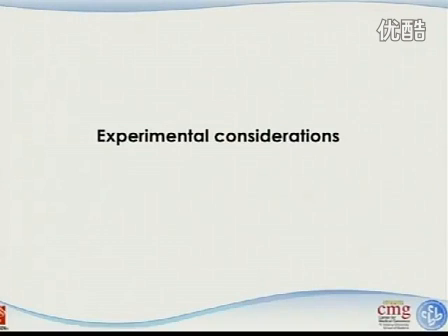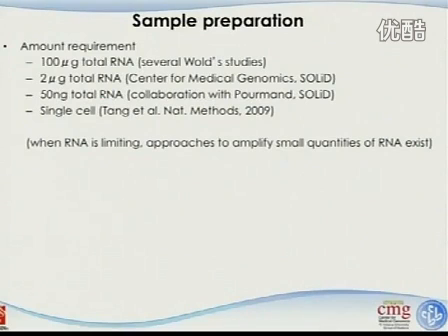Are we okay still? All right, still early to have a break, so let's go through to the next topic, which can be brief: experimental considerations. Once you do, as a biologist, when you do the RNA sequencing experiment, the first thing that you want to ask is how much initial material do I need to provide, right? This is not the blood samples. This is not the DNA sequencing, where you get the blood and you do the work, right? Although we don't have a limited amount of blood, we still have a lot, right?